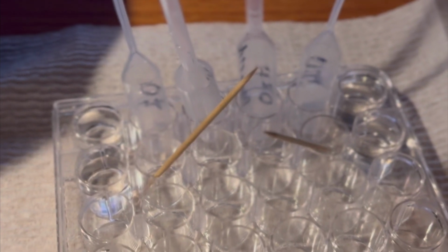Now we will stir each of the wells with a toothpick. So let's grab this toothpick, and we'll stir the wells. Stir each of the 4 wells with a clean toothpick. Now we'll dispose of this. And now it says to add 2.0 milliliters of distilled water to well D1 using this distilled water pipette right here.